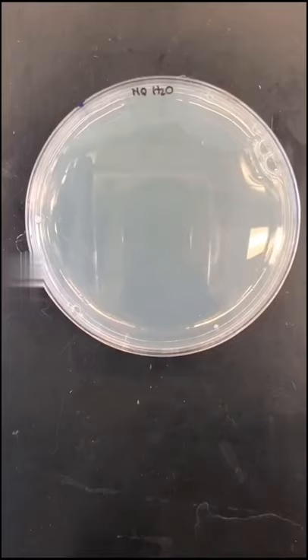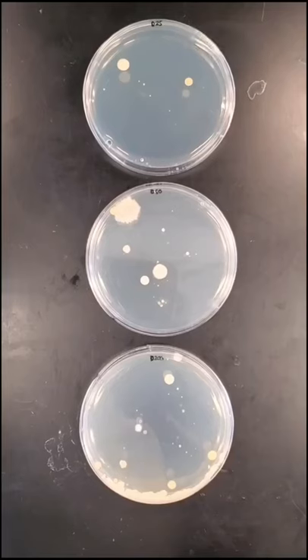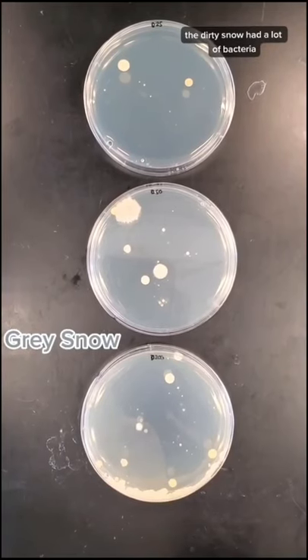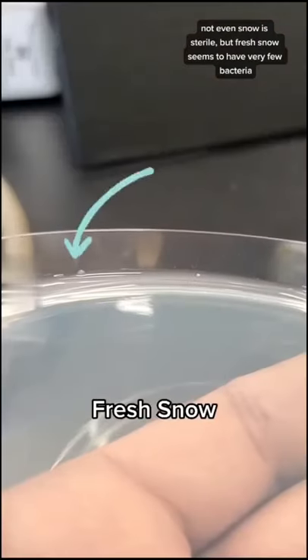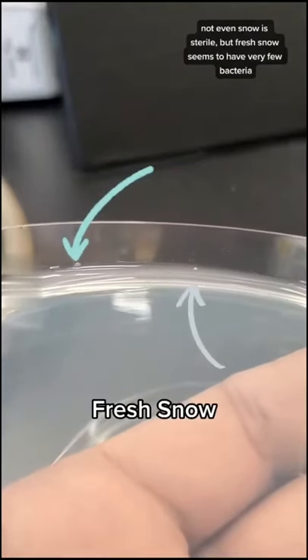Three days later, the negative control had no growth, the dirty snow had a lot of bacteria, and there were a few small colonies which grew from the fresh snow. Not even snow is sterile, but fresh snow seems to have very few bacteria.